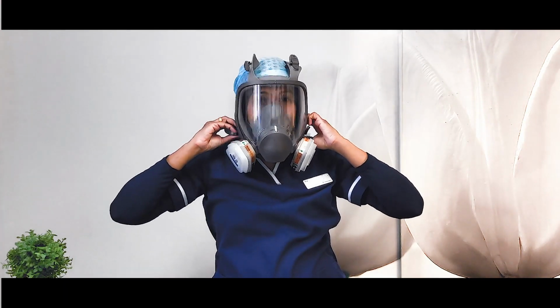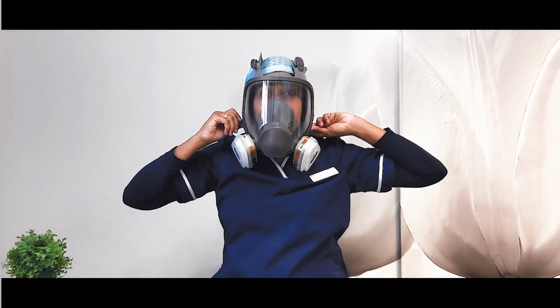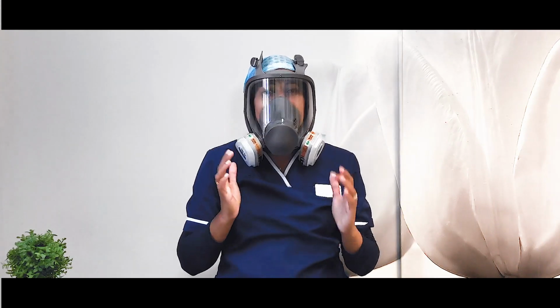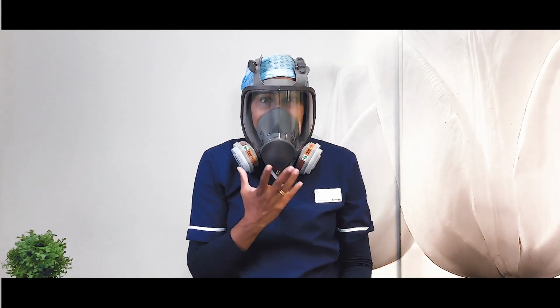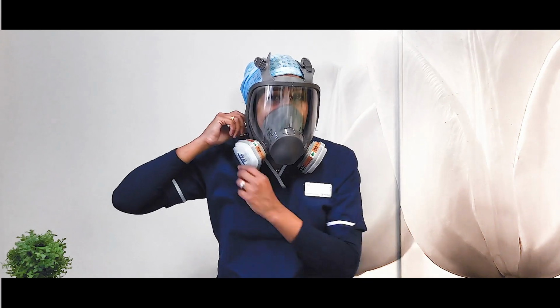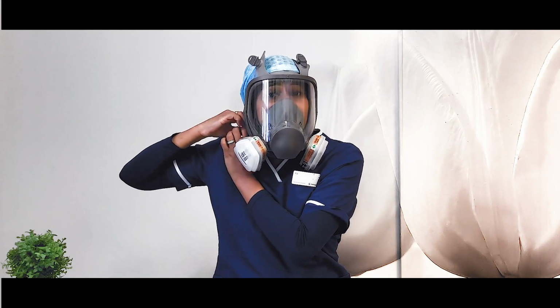With these I couldn't wear my loops because there is not enough space in here to wear your loops, and then you just tighten it, and as you can hear, the voice is not very clear, but my visibility is very good. So although I can't wear my loops, my visibility is very good, and it is quite comfortable. So this is a full face shield respirator.